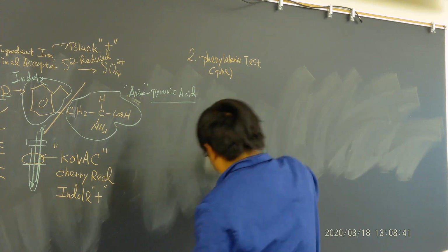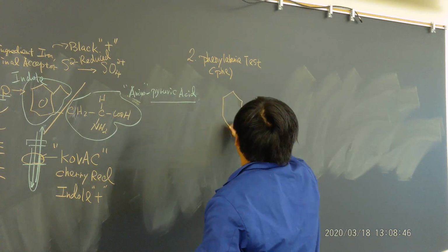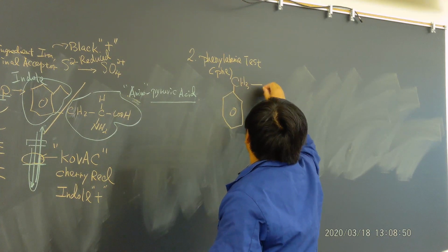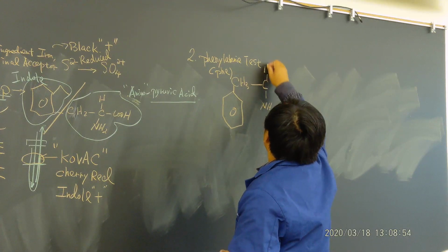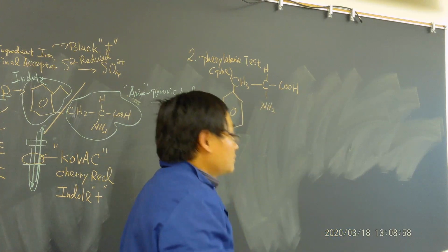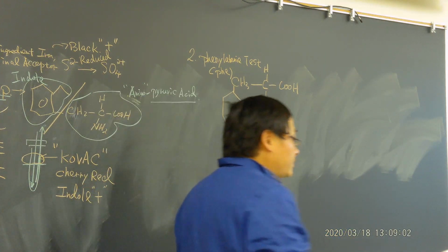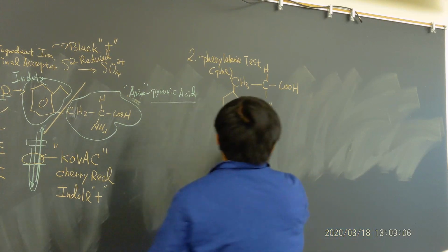Not this one. This is phenylalanine. It's an amino acid. Bacteria can use it. Now, how do bacteria use it? They do deaminase.